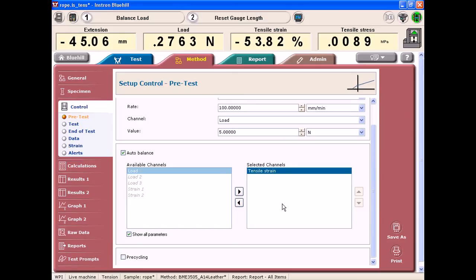Well, because again there is a slack length in this rope, and I want to get that slack length out. It's even a bigger problem with viscoelastic nonlinear tendons where there can be slack length and relaxation or creep of the material, and it's nonlinear. We have to define when do we actually define zero strain.